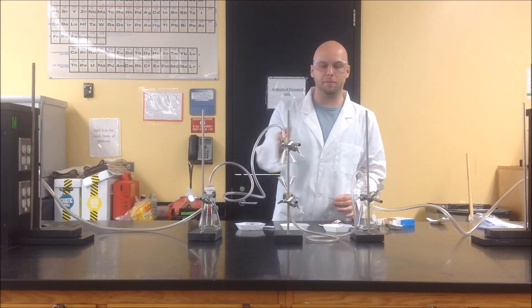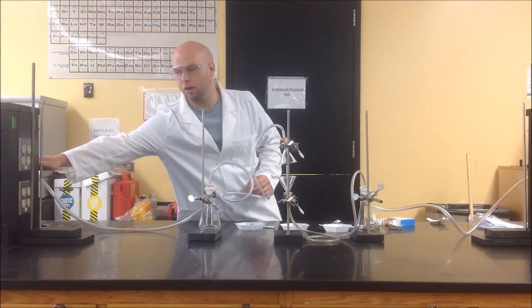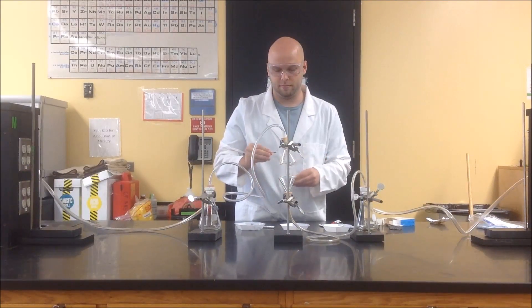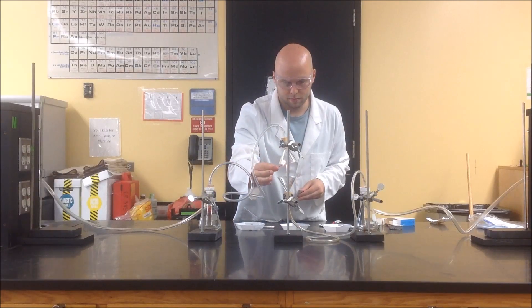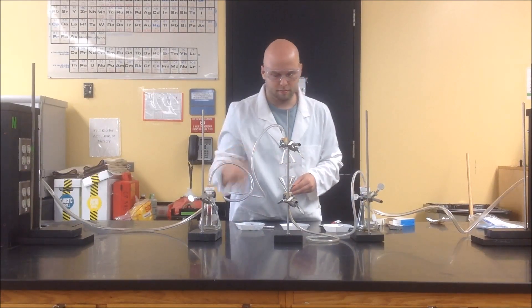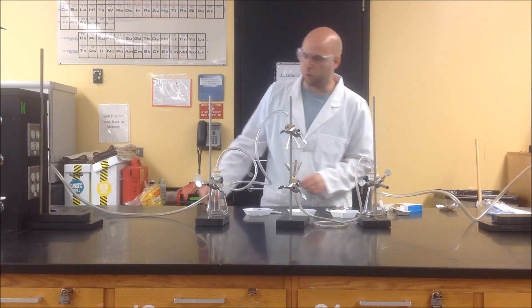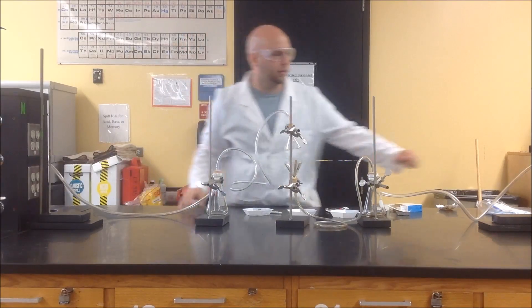Finally, with the exact same procedure as with the unfiltered cigarette, we're going to do the filtered cigarette. We have our filter papers placed in front of the stoppers, we turn on our vacuums, and then we light the cigar on fire after initially weighing the filter papers and turning on the vacuums.